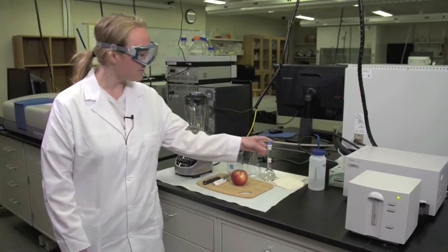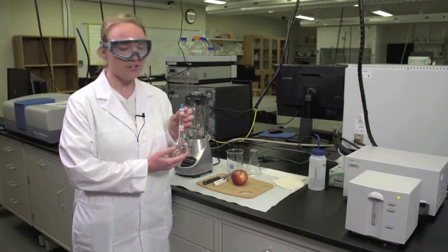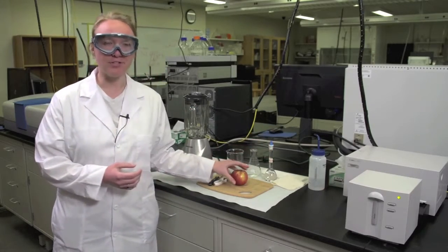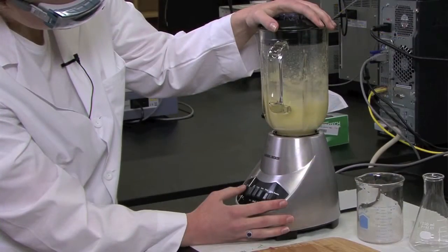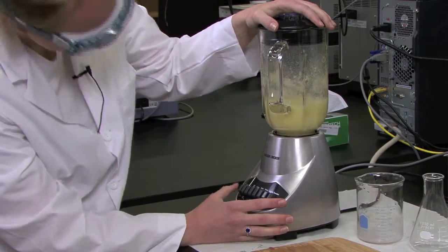Next, prepare your catechol solution, which is the substrate for this reaction, following the instructions in your lab manual. Then prepare the apple enzyme solution by peeling the apple, cutting it up, and putting it in the blender with 200 milliliters of ice and water. Blend until smooth.